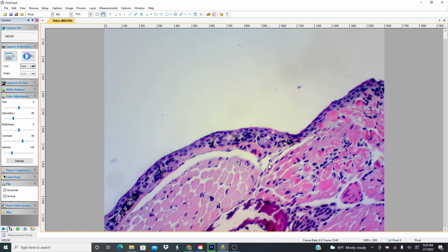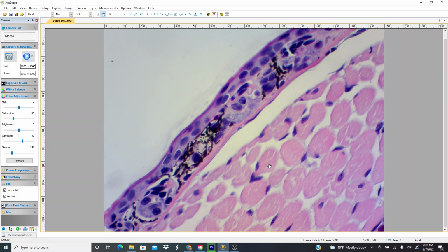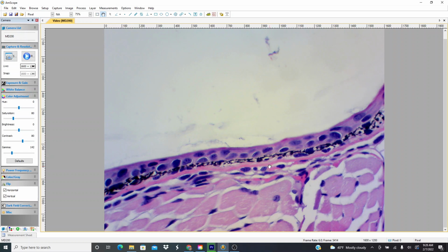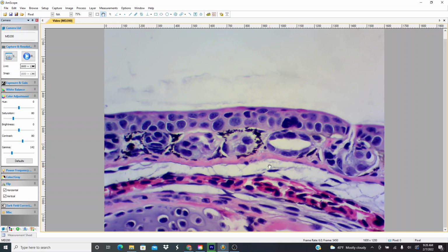Another thing that's funny, you see this pigment right here, and I guess you would call it the skin of the salamander. This dark stuff. It was a dark appearing salamander. So I guess that's the pigment. Pretty cool.